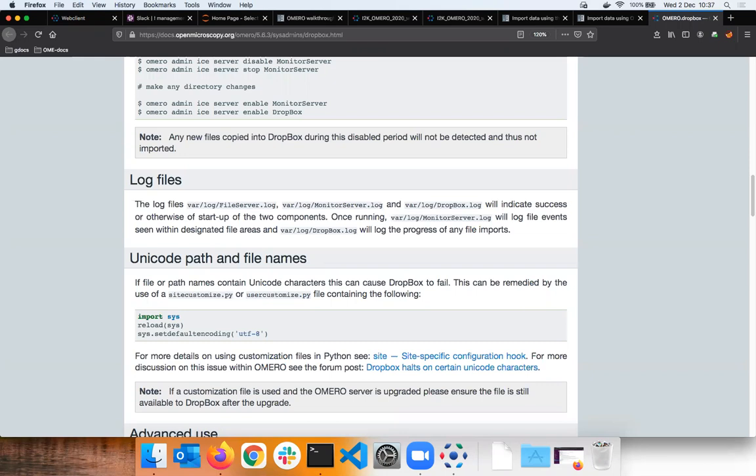Okay. Can I squeeze in one more tiny question? Of course. Just about the in-place import as well. If we do an in-place import with a folder that has folders inside, what does the import look like?